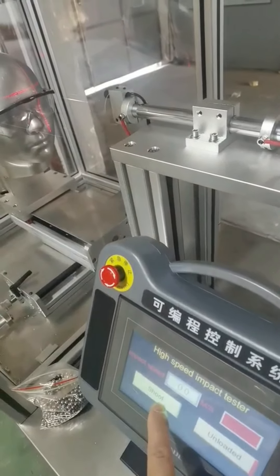You can choose the test method for goggles, face shield, or welding elements. Place the steel ball into the shooting rod and choose loaded.